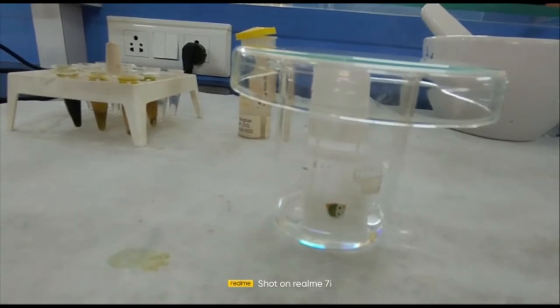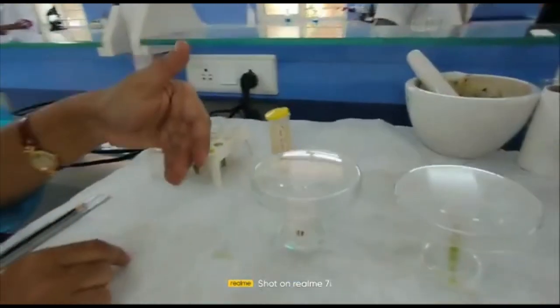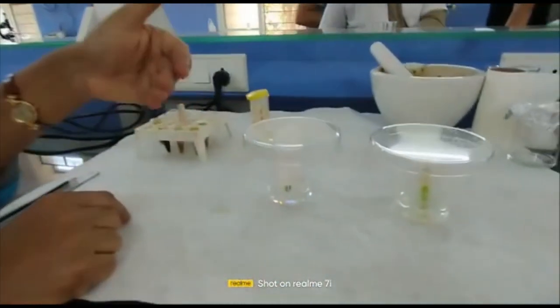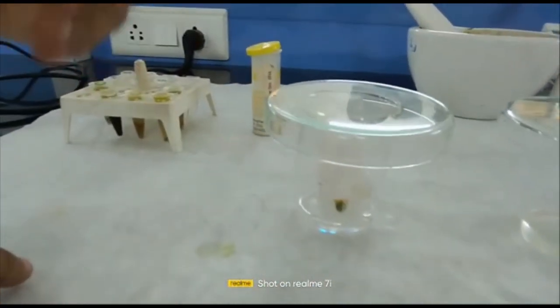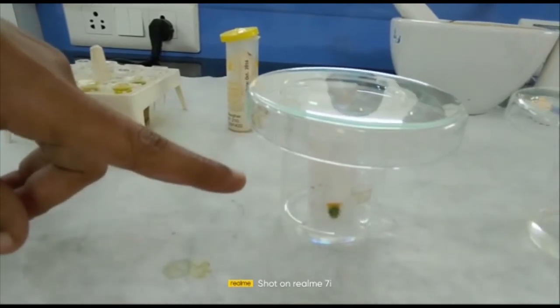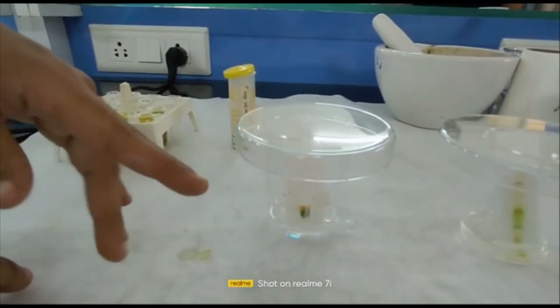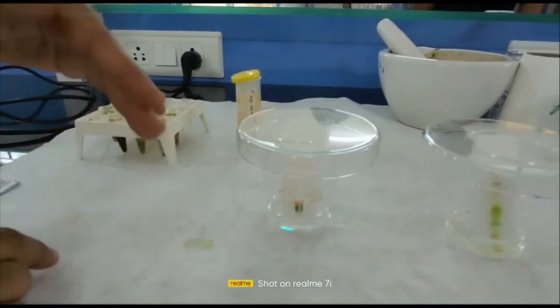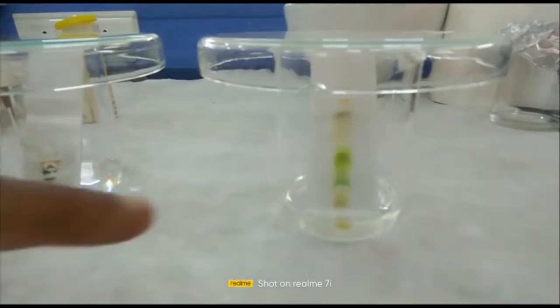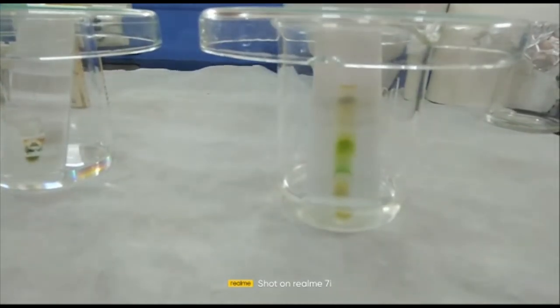The first pigment — carotenoids, orange in color — is getting separated and moving along with the mobile phase. This is the principle of thin layer chromatography: the plant pigment with more affinity towards the mobile phase moves faster compared to the sample with more affinity towards the stationary phase. In less than a minute you can see the orange carotenoids separating out. Over time, the chlorophyll pigments will also get separated.